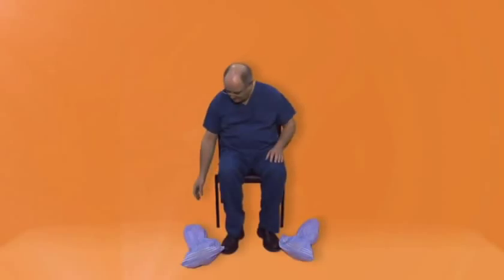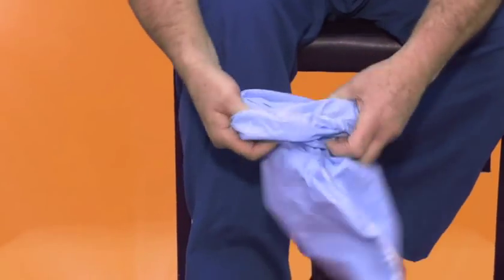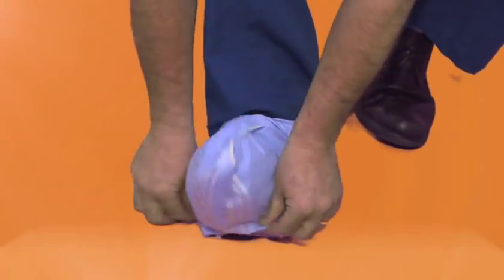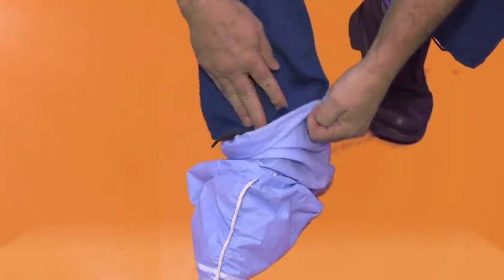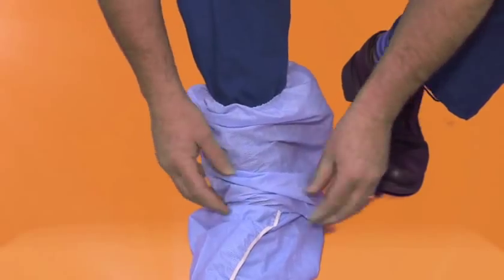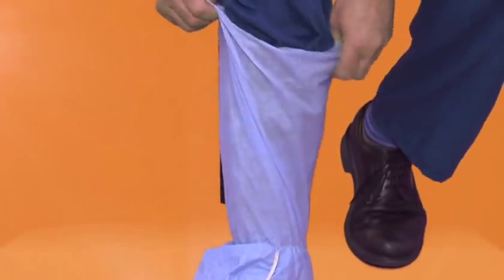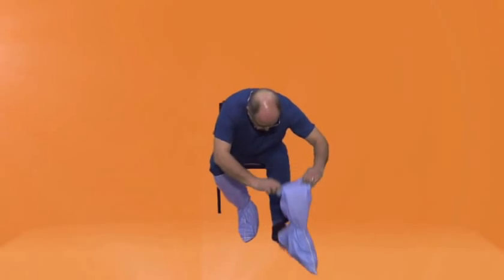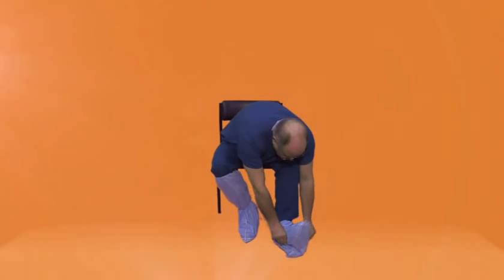Putting on protective footwear. Sit down on a firm, stable and cleanable seat. Apply the protective footwear one foot at a time using the ankle elastic and pull over the heel and up the trouser leg. Use the seam as a guide to ensure the correct placement on your feet. The seam should be at the centre of your foot.